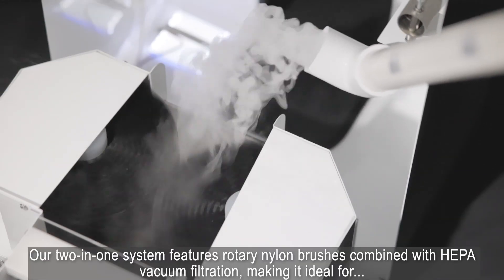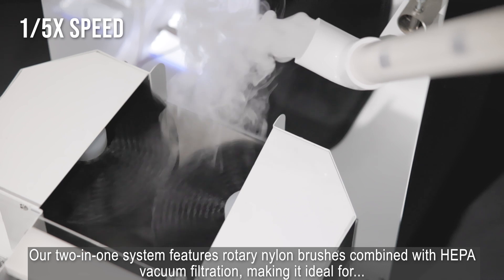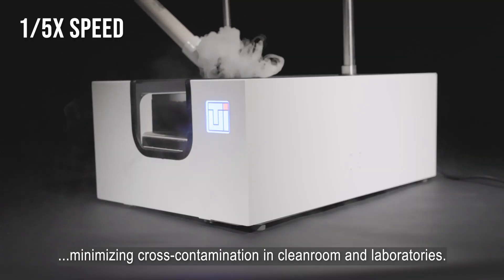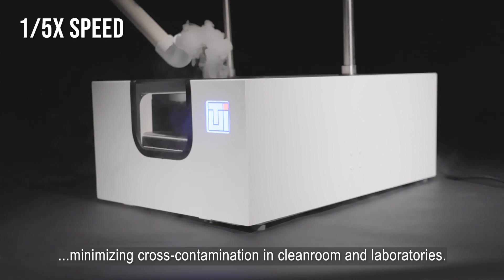Our 2-in-1 system features rotary nylon brushes combined with HEPA vacuum filtration, making it ideal for minimizing cross-contamination in cleanrooms and laboratories.